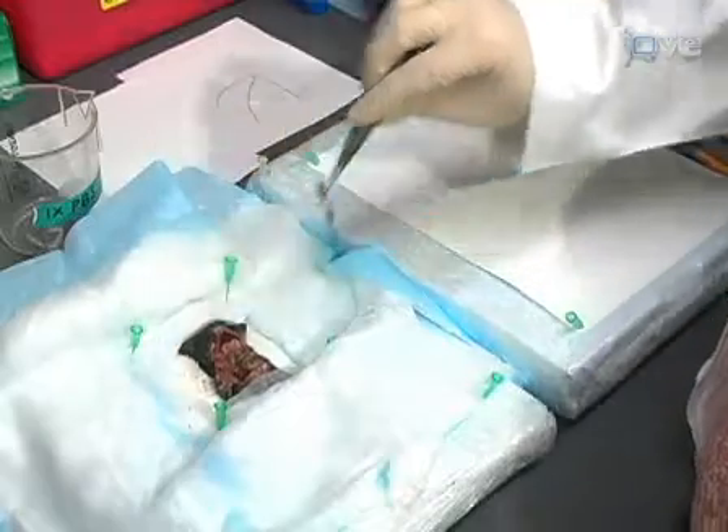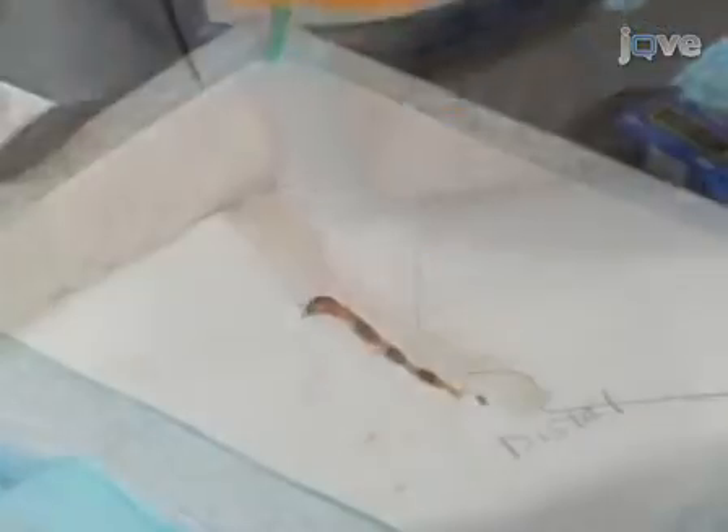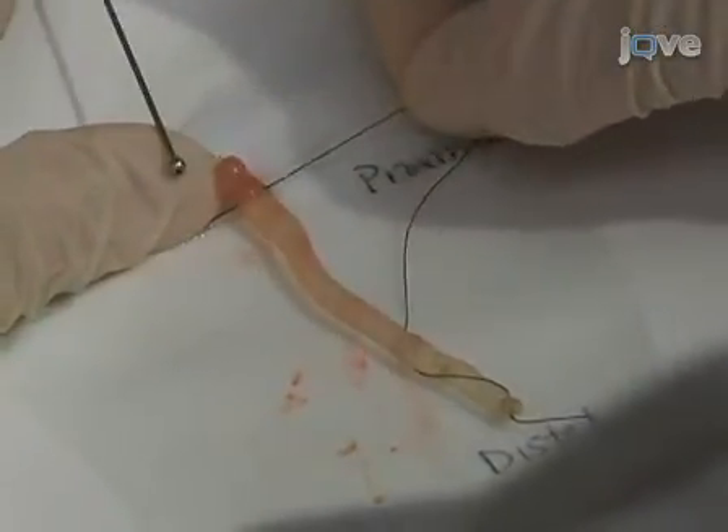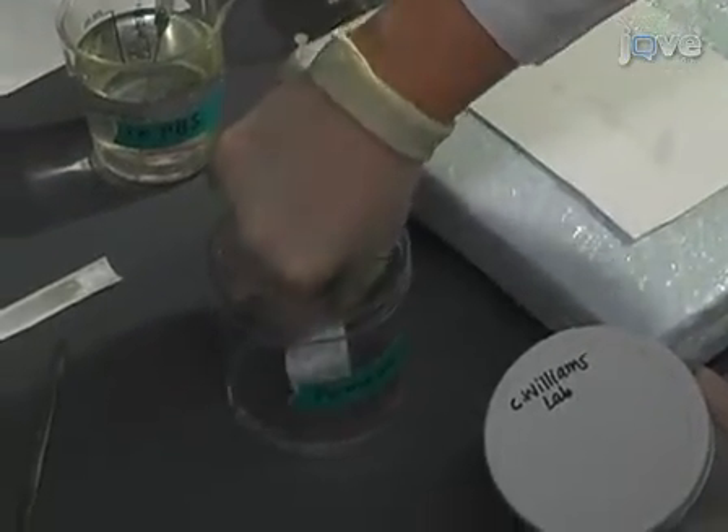This video article will demonstrate the harvesting and processing of colons in a murine model of colitis. This procedure is used to study colitis in the laboratory of Dr. Christopher Williams of the Department of Cancer Biology at Vanderbilt University.